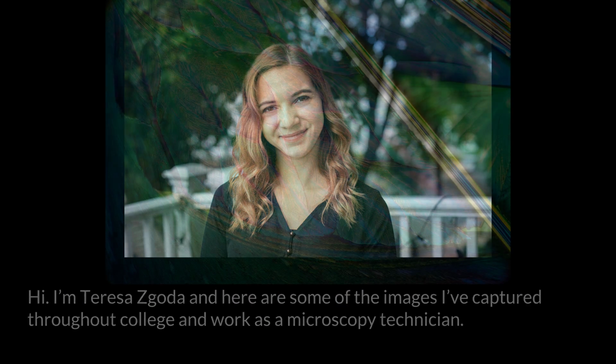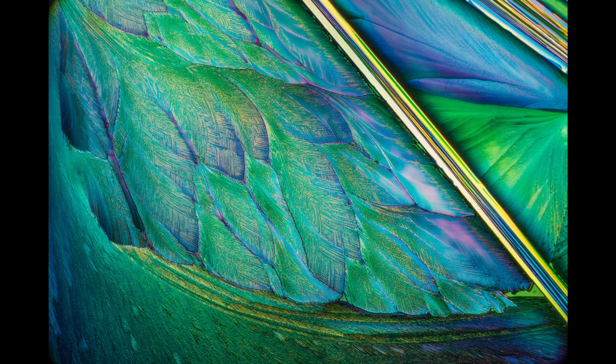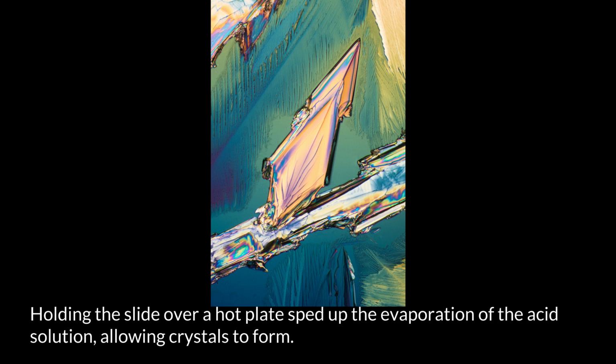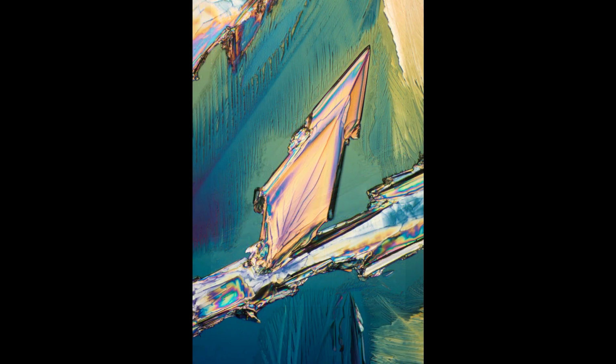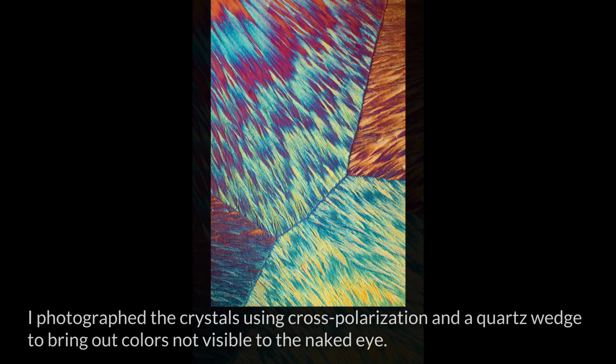These crystal melts were made by dissolving hippuric acid crystals or granulated urea in isopropyl alcohol, then placing the solution on a slide. Holding the slide over a hot plate sped up the evaporation of the acid solution, allowing crystals to form. I photographed the crystals using cross-polarization and a quartz wedge to bring out colors not visible to the naked eye.